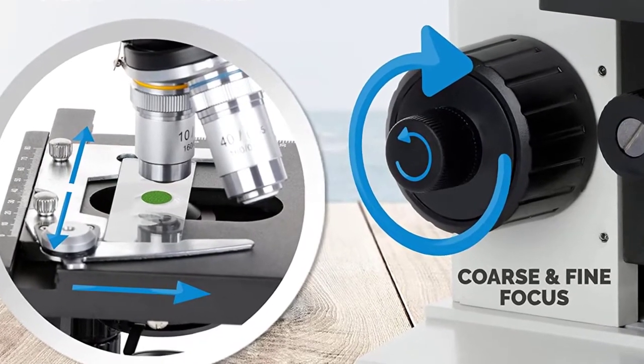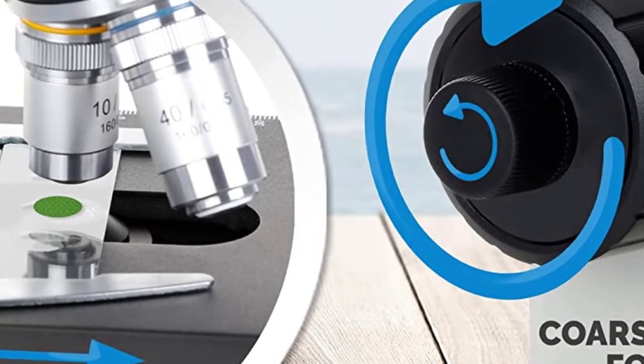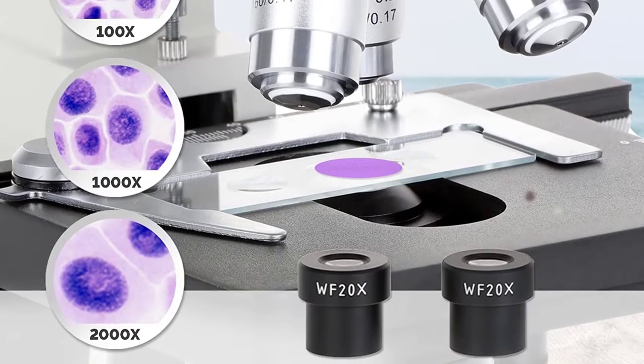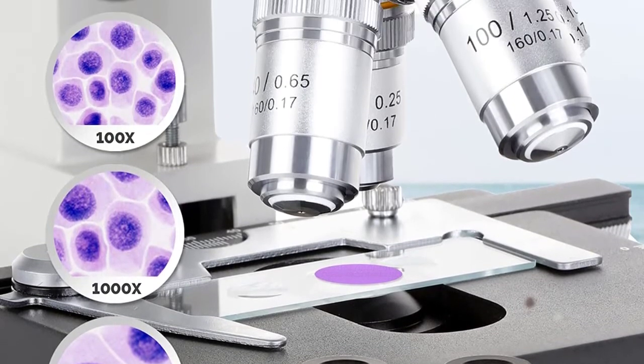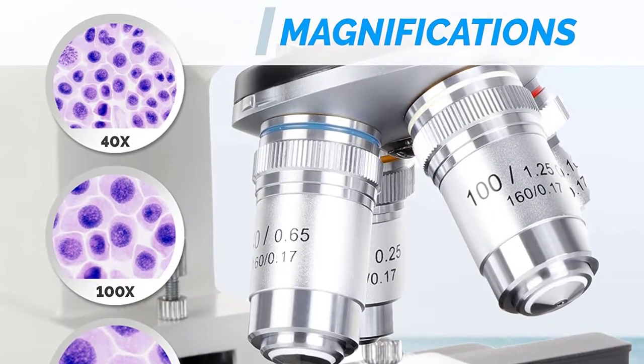Stage: double layer XY mechanical stage with scales, size 115mm by 125mm, translation range 70mm by 30mm. Stage upward moving lock protects objectives and slides.